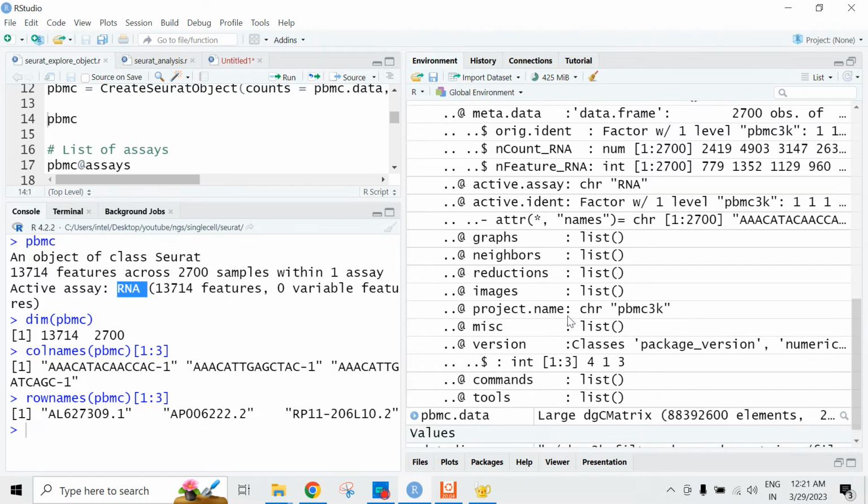So now you can see that it is a blank canvas kind of thing. Everything is empty, but as and when we do the analysis, all the results will be stored in this single object. So we don't have to create multiple variables, like PCA results stored in a PCA variable and clustering results stored in a cluster variable. No need to do that. Just the single object, and there we can store all the results. That's the beauty of object oriented programming in R, as with objects. Okay, so clear.